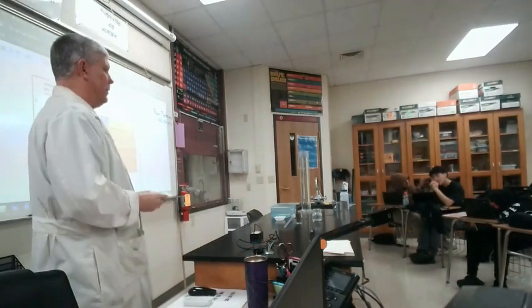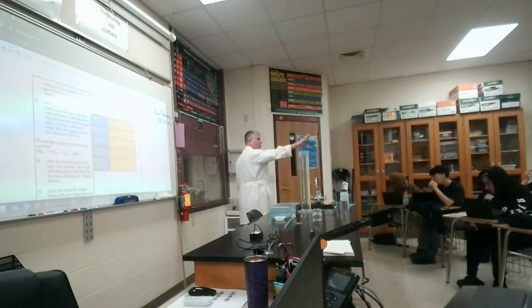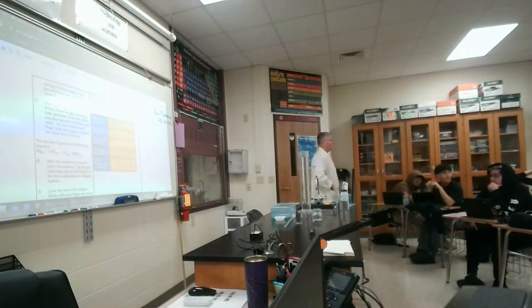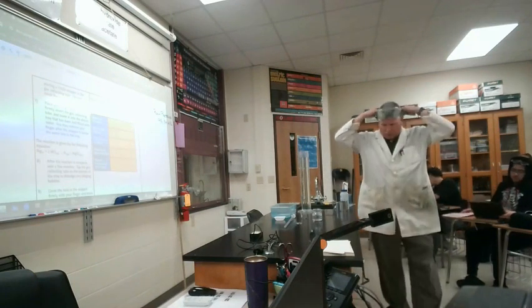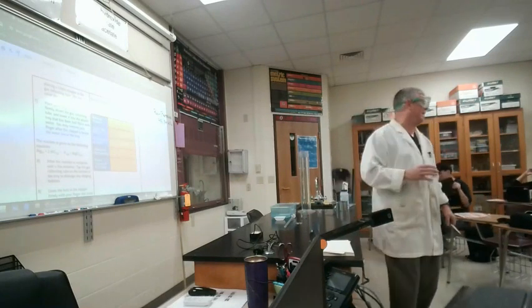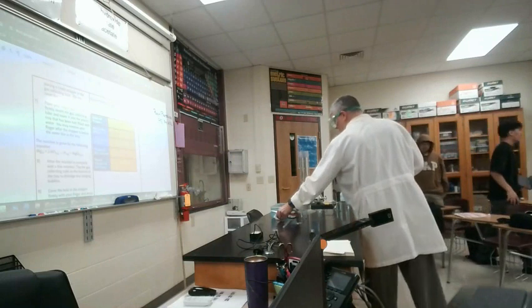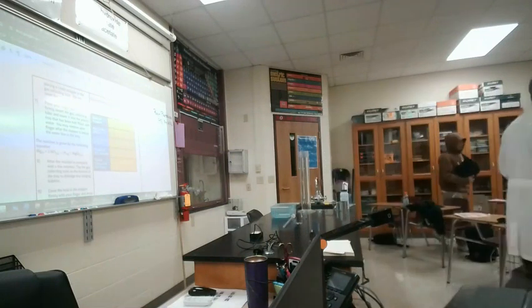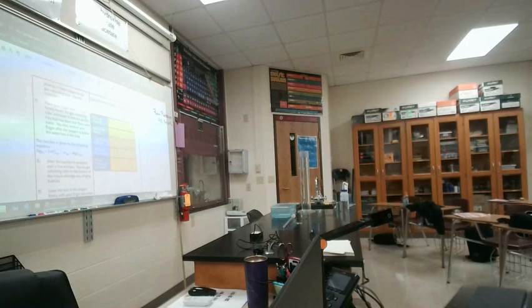All right, ladies and gentlemen. We're up to 20 people. That is 10 groups of 2. Everything is set out at the lab stations. If you want aprons, they're available in the back. Grab your goggles, grab your partner, and go get to work, ladies and gentlemen. Do not measure any magnesium until I come around and cut yours for you. Otherwise, it will be too much, and you will have to do the experiment all over again. Then you find a new partner. Let's go.